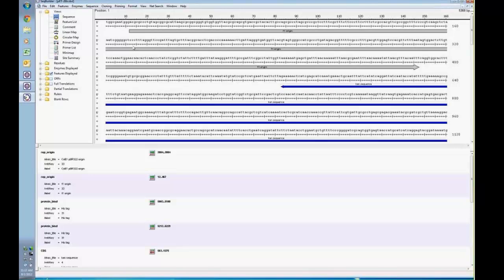One thing that I'd briefly like to mention is, when you download files from various vendors, every once in a while you'll get them in the wrong orientation. So if you would go to the vendor for this vector, for example, it would actually be in the opposite orientation. I've previously made sure that the f1 origin of replication is shown from 5' to 3'.